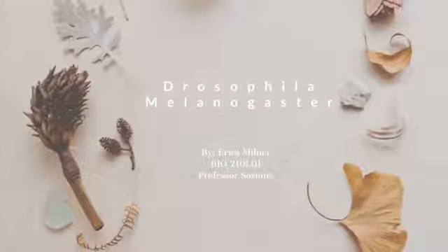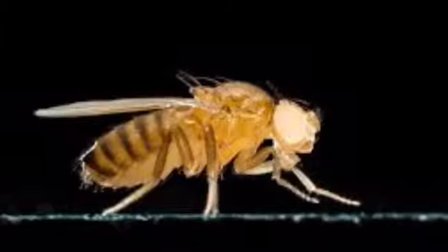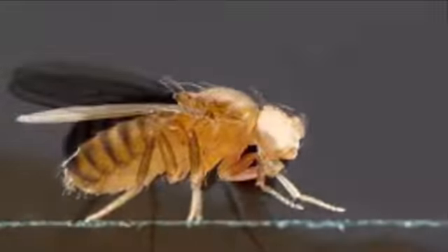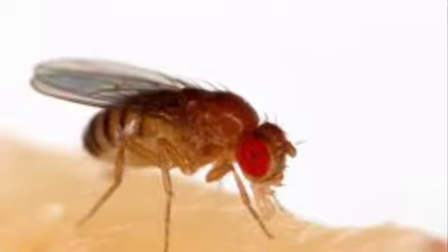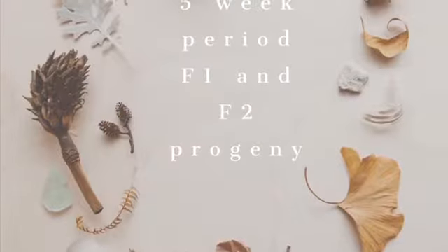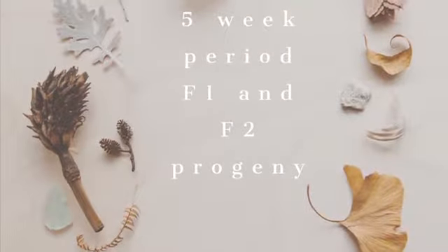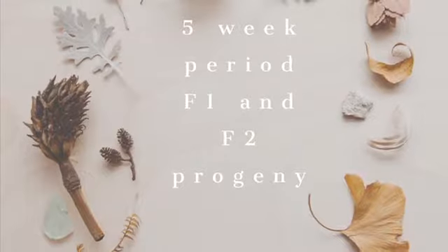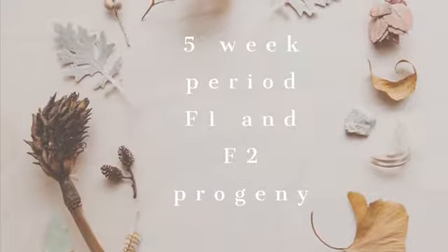In this experiment, two fruit flies, a female virgin with white eyes and a male virgin with wild-type red eyes, were used to determine genotypes and phenotypes of their progeny. This experiment was conducted over a 5-week period and produced an F1 and F2 progeny. The genotypes and phenotypes of the progeny were recorded and compared.